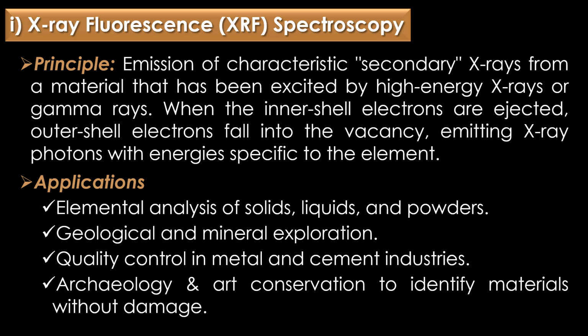The applications are elemental analysis of solid, liquid and powders, geological and mineral exploration, quality control in metal and cement industries, and finally archaeology and art conservation to identify materials without damage.